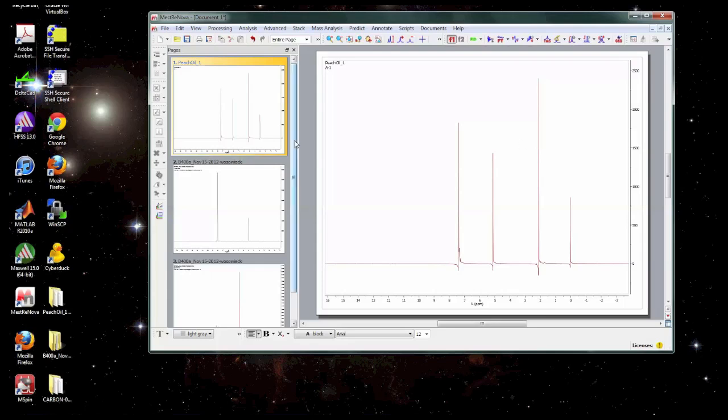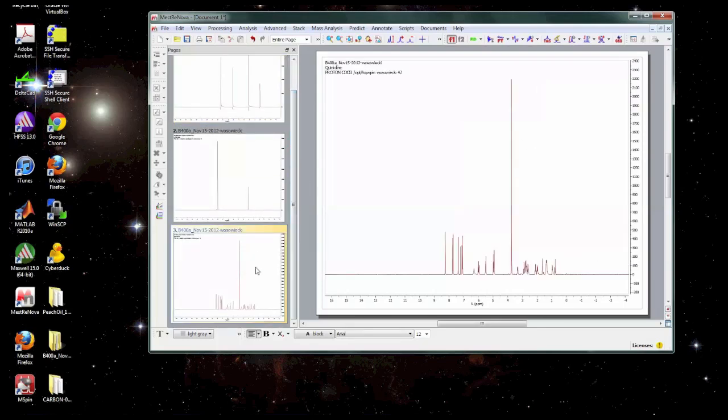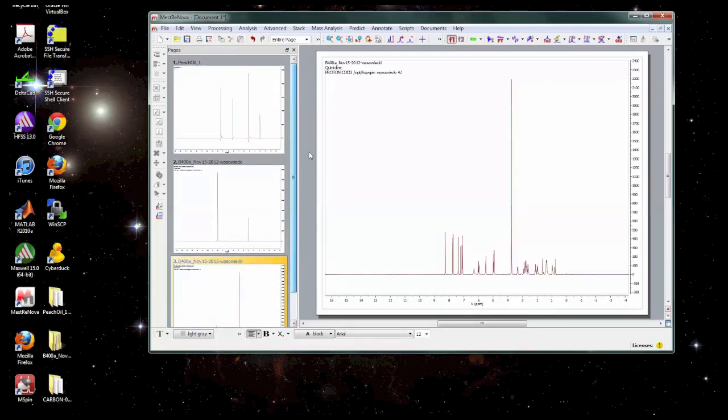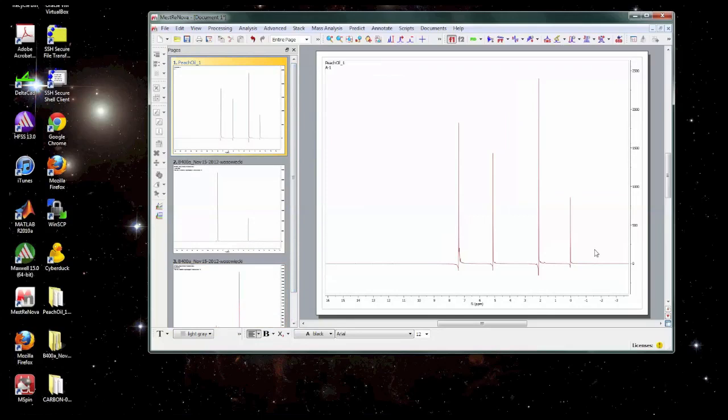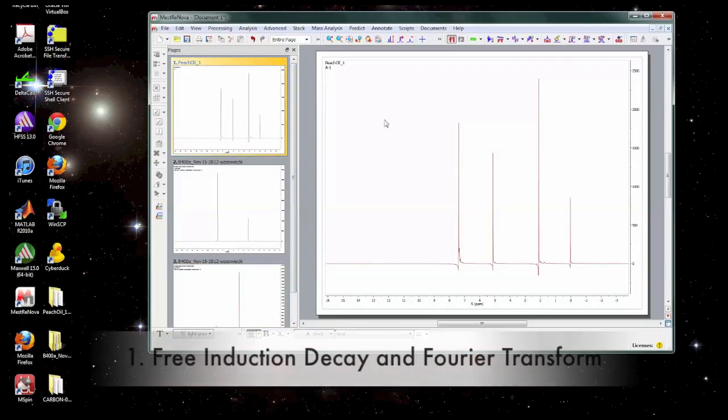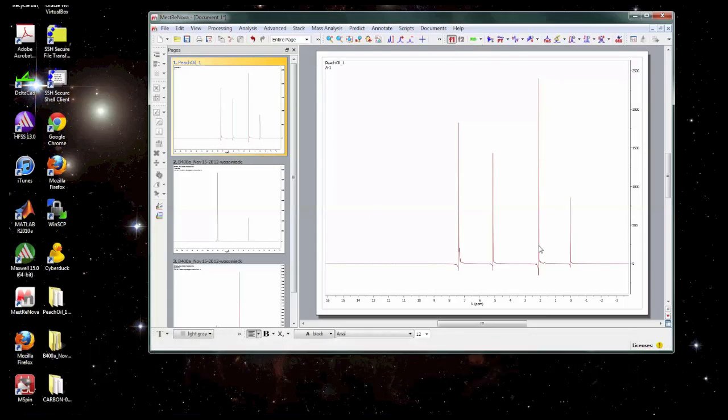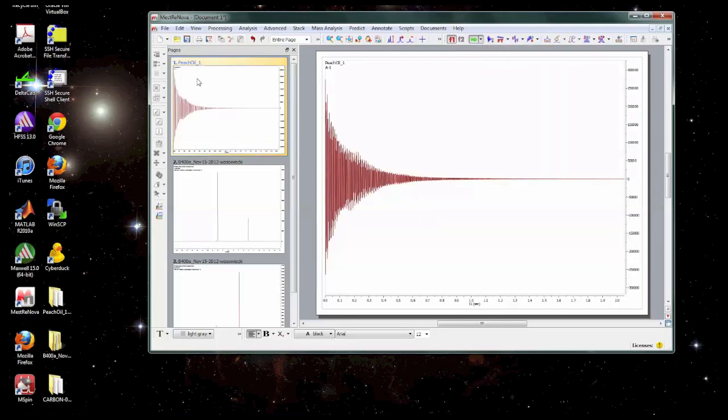So Mestronova has already Fourier transformed and autophased this dataset. In many cases this works well like on this spectrum it's fine but on this particular one it's not been phased very well automatically so we're going to have to fix that manually. But before we get to that I'm going to cover a few basics about how the data is collected just so you know what you're looking at.